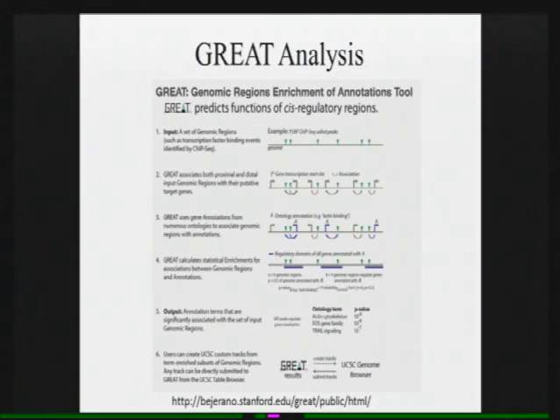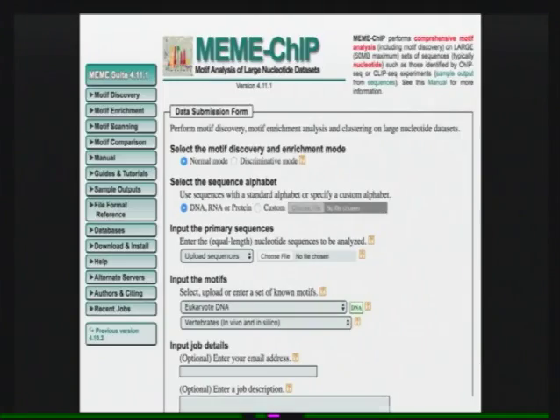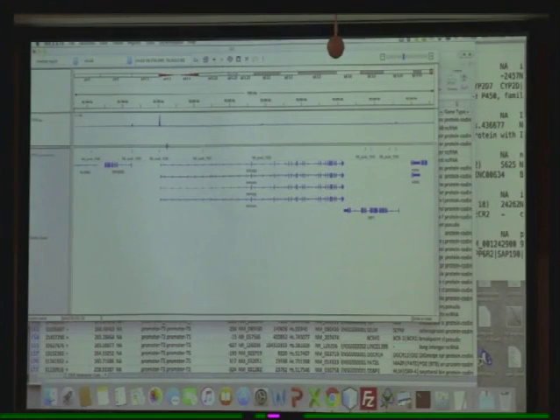So we're going to go to this gene, open up IGV, and look at where this peak is. It's right here. So you can say CTCF probably regulates this gene because it's bound to the transcriptional start site, and you can go on from there. That's a huge peak, because even here it's dwarfed by these other peaks that were called. Okay, so that's how you get the annotation.